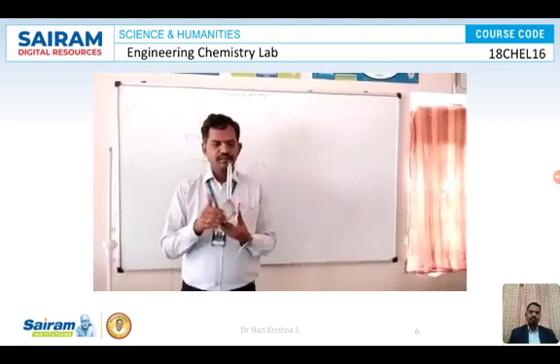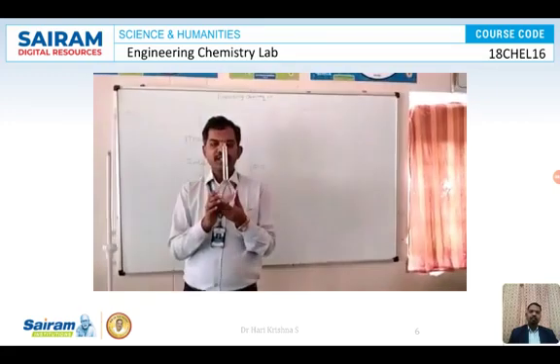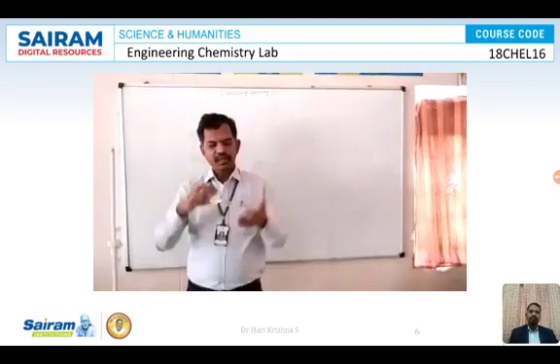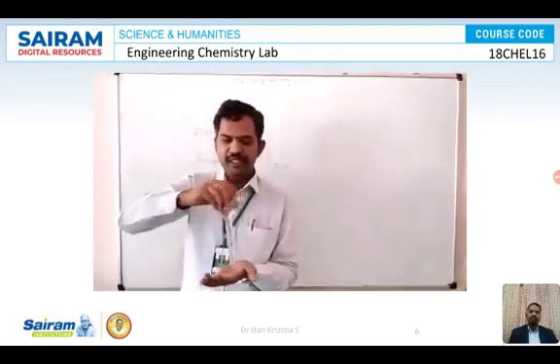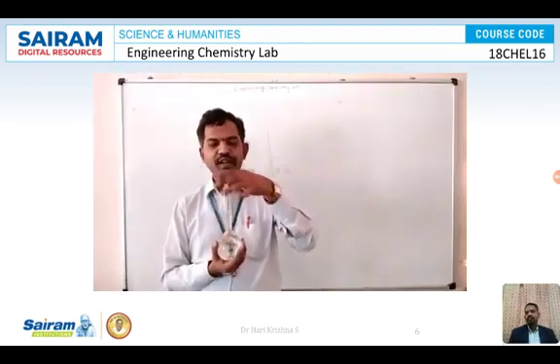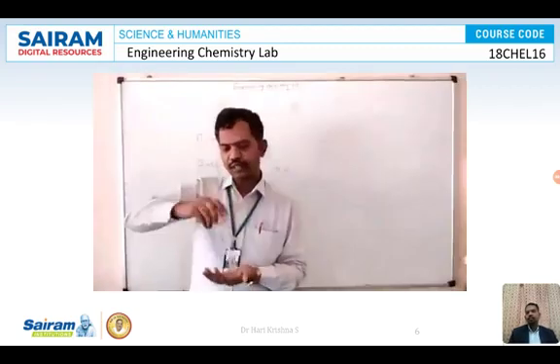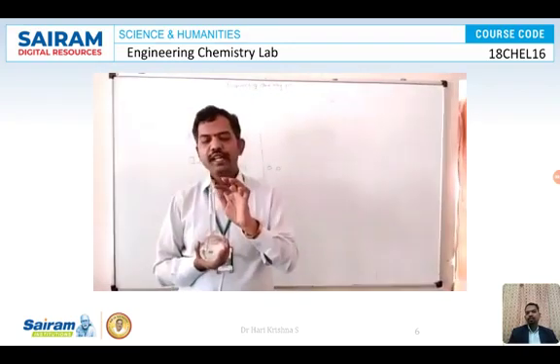Okay. So we added the water up to the mark over here. Once the water is added, we are going to shake it until we get uniform concentration. This is how we are going to shake it and release the pressure. Again, we are going to shake it and release the pressure.